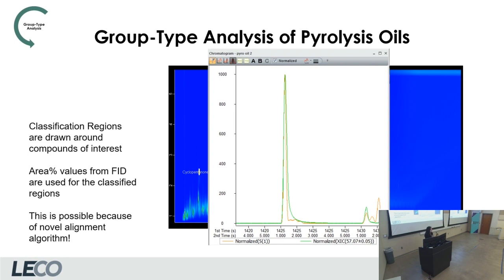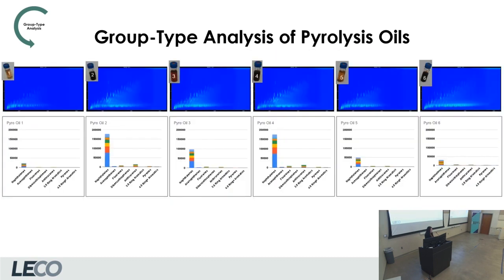And so all those different groups that you have, if you have to draw a lot of those squiggle boundaries with classifications, you'll know that having that basically perfect alignment when you're splitting gives you a really, really easy way of transferring the information from mass spec back to your FID.